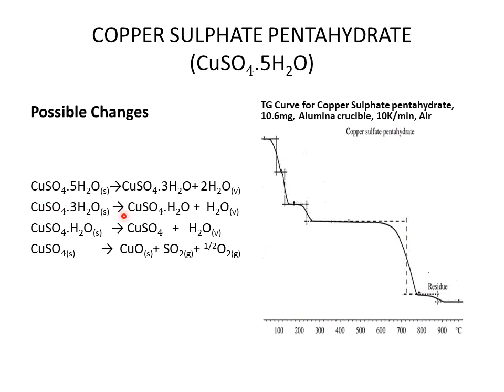Then in the second step, this trihydrate is further heated, and again two water molecules are removed. Sorry, here the 2 is missing, so you must understand that again 2 water molecules are lost, and we get the copper sulfate monohydrate molecule. And then in the third step, when copper sulfate monohydrate is heated, this single water molecule is removed and we get copper sulfate.